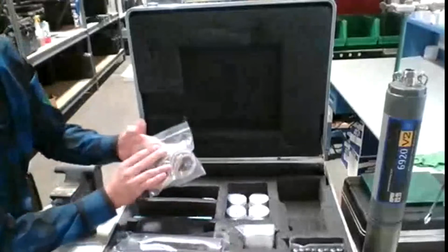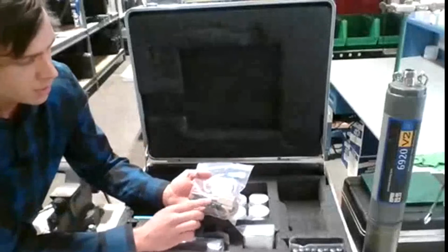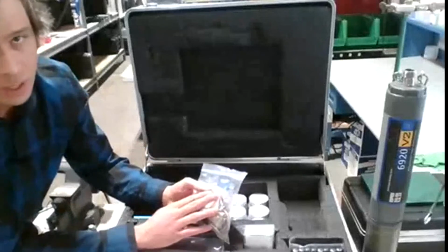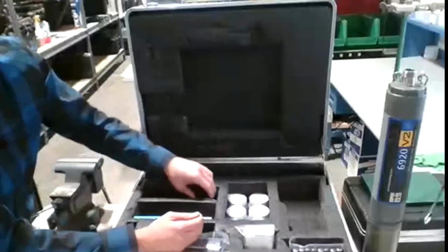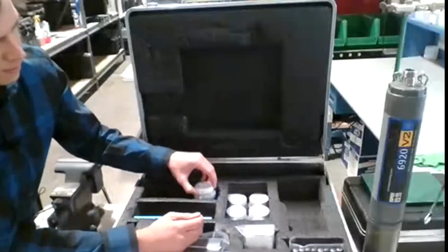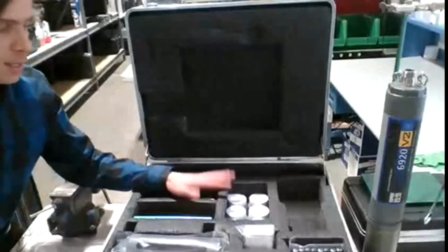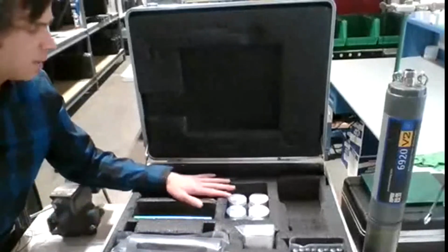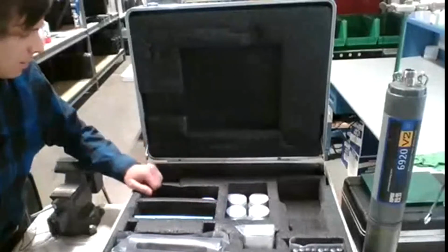Second, lastly, we have our communication cable here. It's a Prolific cable and a serial cable with the software. The software is really easy to use. It's called YSI EcoWatch Lite. And when you export your data, it actually exports it as a CSV or Excel, making it that much easier. So you don't really have to play with anything.